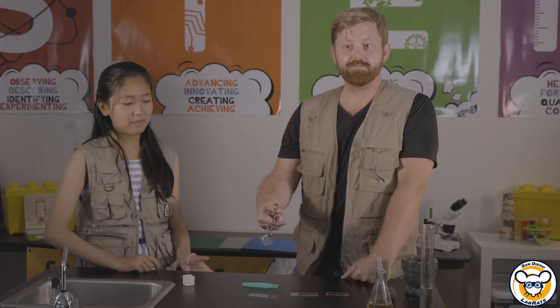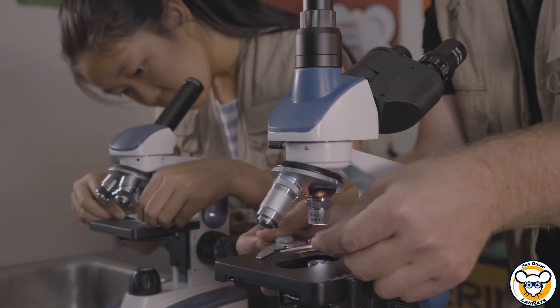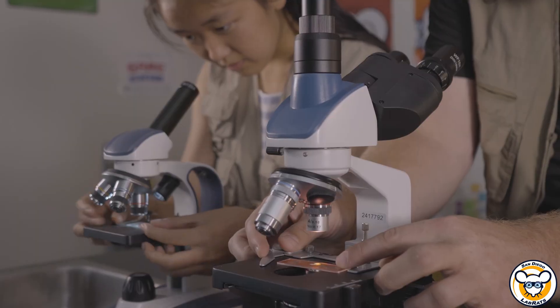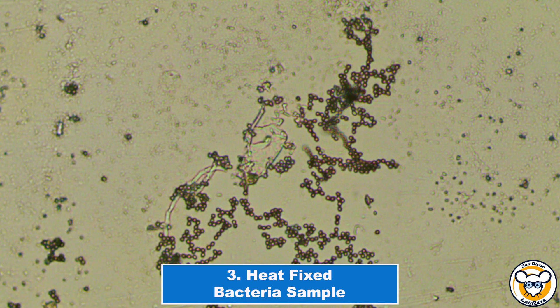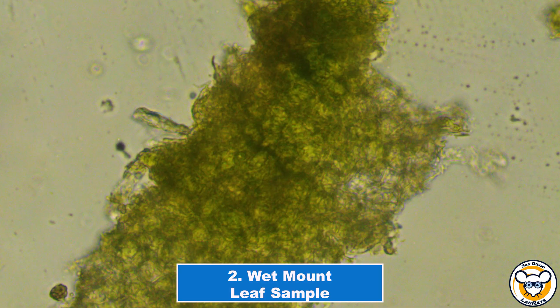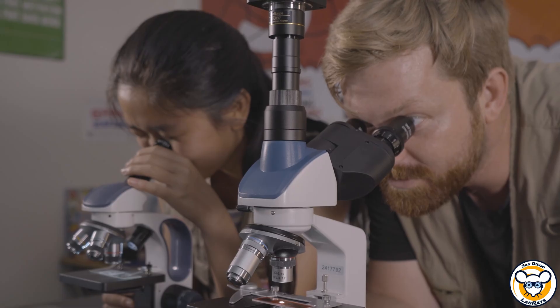This is ready for staining or whatever next steps you want to take. It is heat fixed on there and will not go away. After you've prepared your microscope slides, you're now ready to visualize them. When you have your slide ready, making sure that the platform is all the way down, you'll take your slide — this is our heat fix sample — place it on the platform, let the clamp go down, and now you're ready to go. We'll be right back.